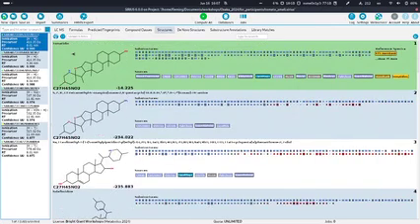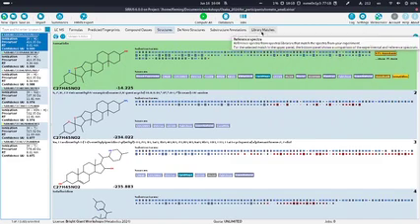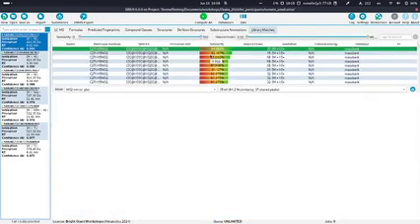One feature I want to show very quickly is this one. This is named tomatidine, so we really expect this here. And what I will not show you very much here, but actually we had a hit in our reference spectral library. So we used MassBank. This is, as Kai said, the MGF file you downloaded. And here we had a good hit in MassBank. Because we have not opened the custom database here, I cannot show you the mirror plot of the MS2, but we can still see our list of hits and can see the similarity and so on.